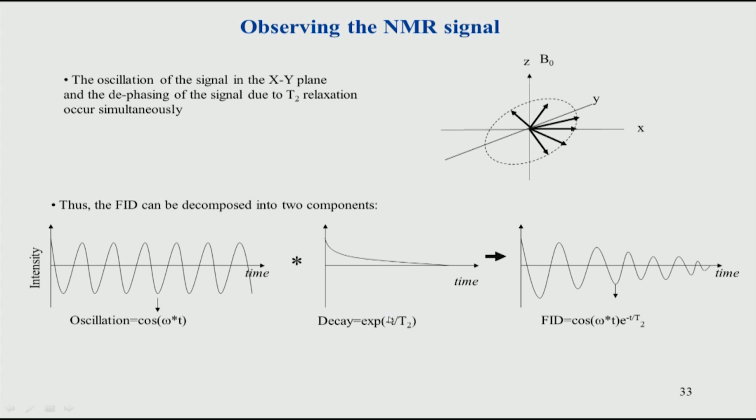And so on. So, this is how the exponential decay is depicted, and now this is a decay, but the oscillation is captured here. The oscillation of the FID is because of the rotation of the spins along the xy plane, because they are essentially precessing around the z axis. That precession, which is the Larmor precession, is what is shown here. This is nothing but a Larmor precession shown in a simple sinusoidal, oscillating manner, and this is nothing but a simple sinusoid function, cosine of omega t.